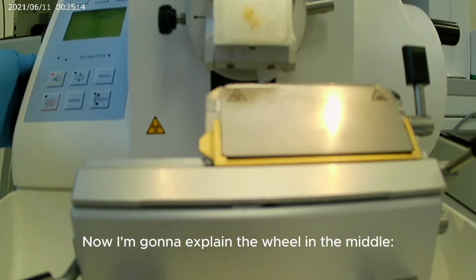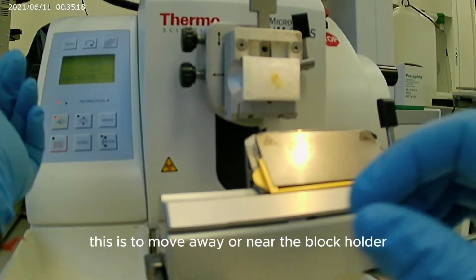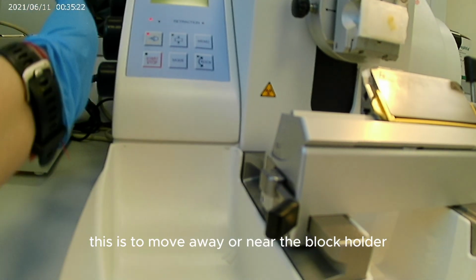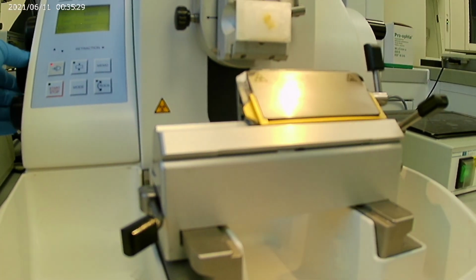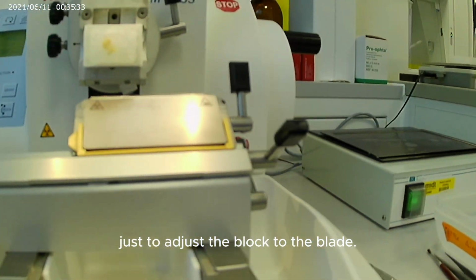Now I'm going to explain the wheel in the middle. This is to move the block holder away or near, just to adjust the block to the blade.